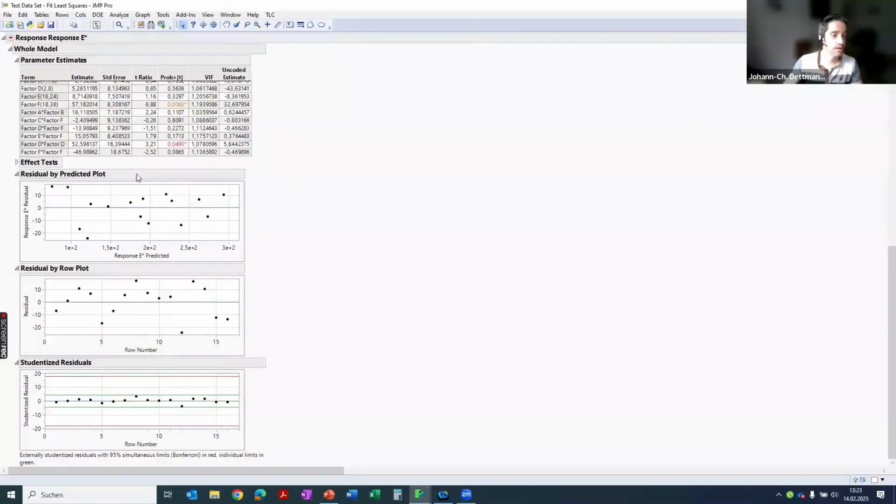That means that we are looking at the residuals of our model to see if there are specific patterns in the residuals which would indicate the presence of an unknown active effect. Ideally, the residuals should be randomly scattered around the 0 line. Here the blue line indicates a normal distribution of the residuals, which is the case in our situation.